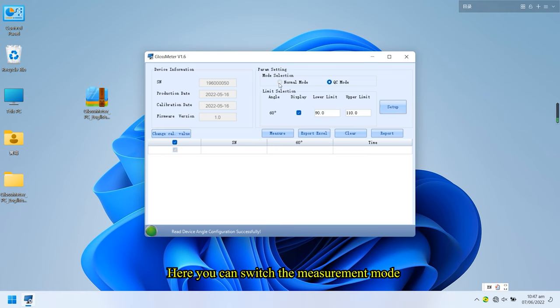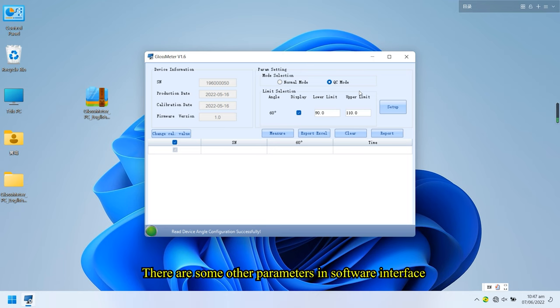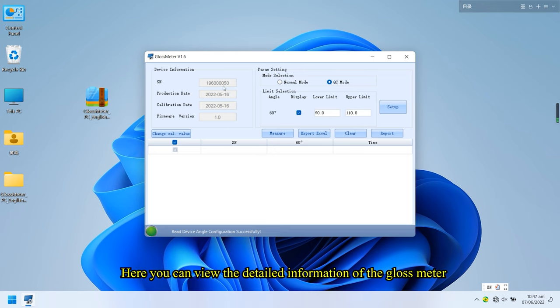Here you can switch the measurement mode. There are some other parameters in software interface. Here you can view the detailed information of the gloss meter.